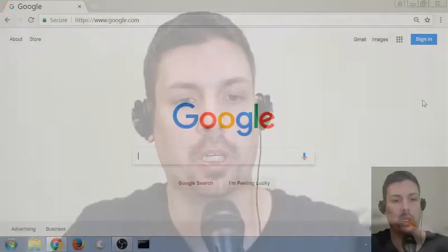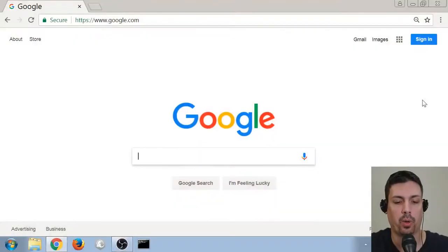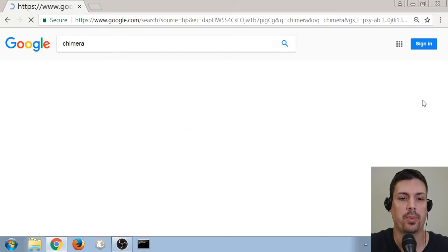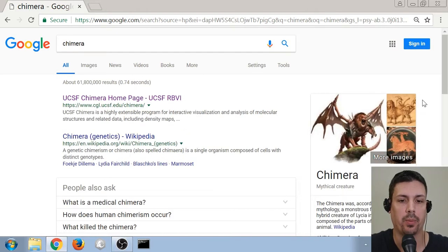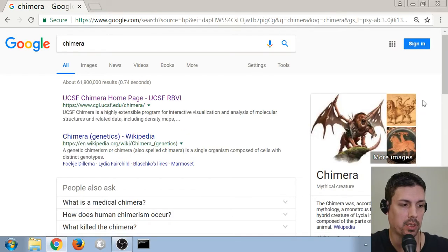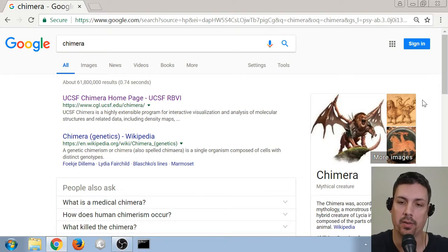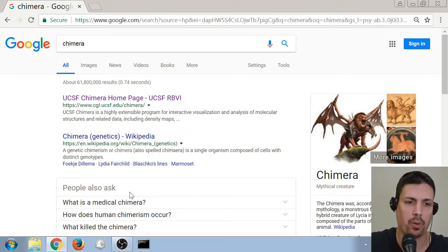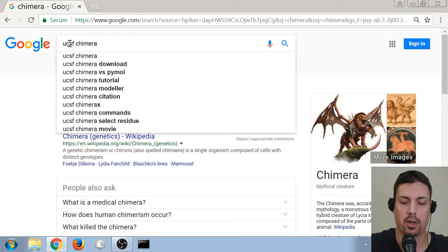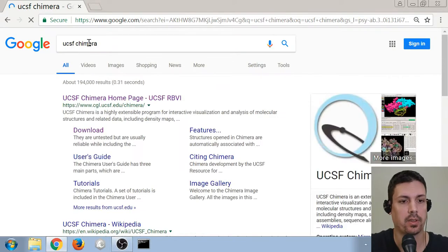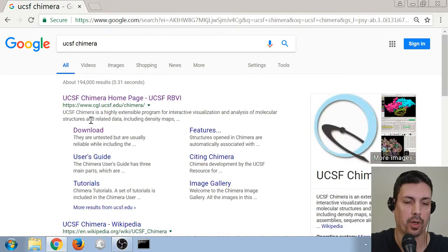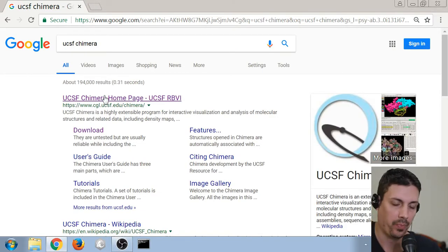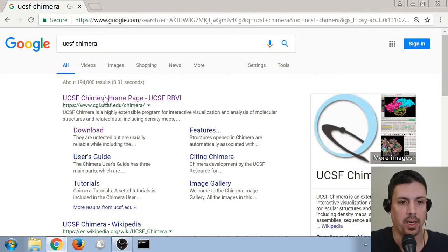So, the first step we're going to need to do is open up our web browser. And if we search for just Chimera, we're going to end up with the mythical monster consisting of the head of the lion, the body of a goat, and the tail of a snake. Not really what we're looking for. We are interested in the UCSF Chimera version of it. And I see that Google has remembered my history, so that was the number one hit.